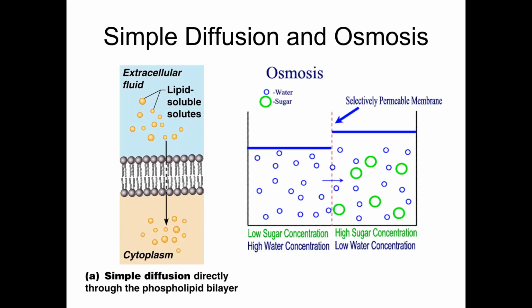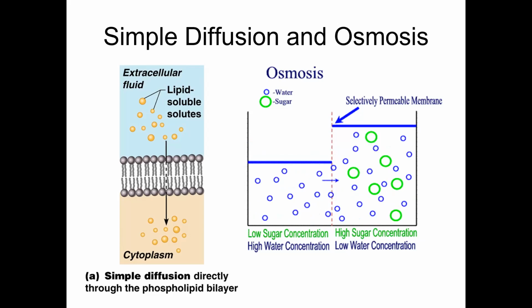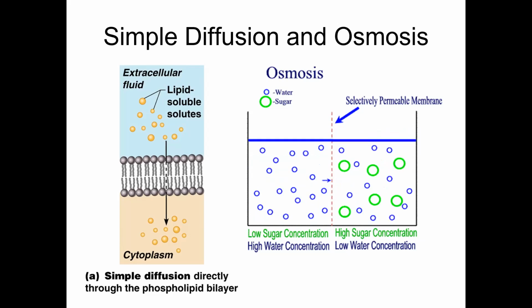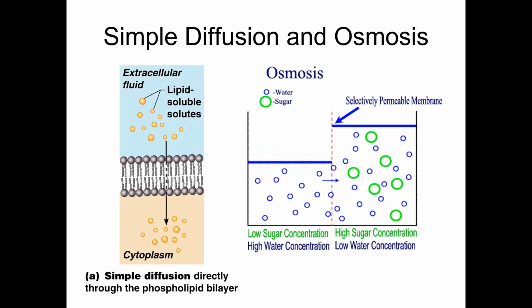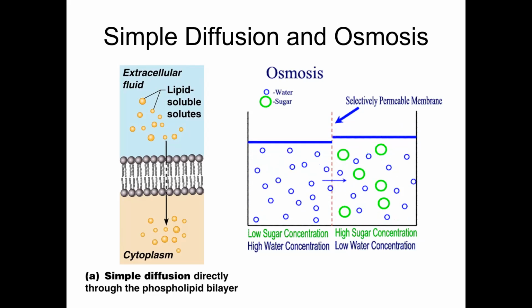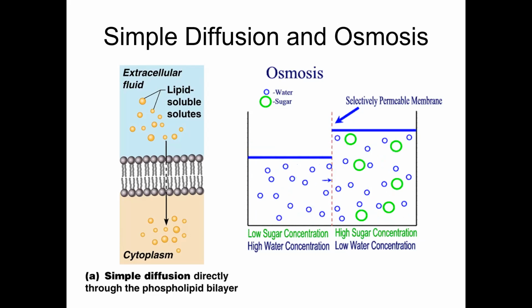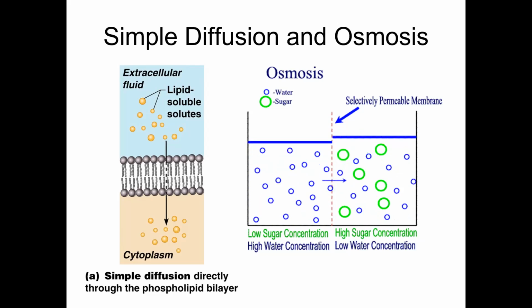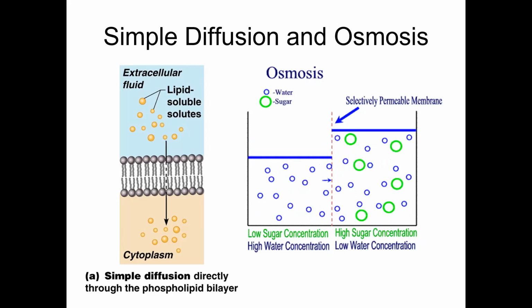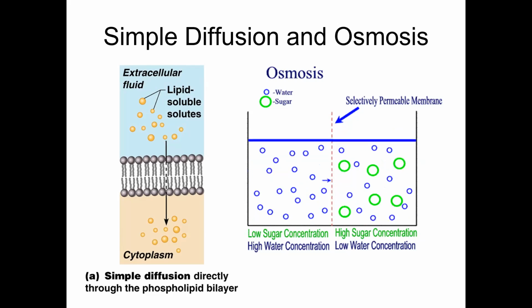And what I did was I weighed the artificial cells before we started. The cell with the sodium chloride in it weighed 33.8 grams. If water goes into that cell, we should see a weight increase over the next hour or so. The other beaker was 10% salt water, and I put in a cell that's 100% distilled water. So we have 100% water in the cell and 90% in the beaker, and that cell should lose weight if it's going to work.